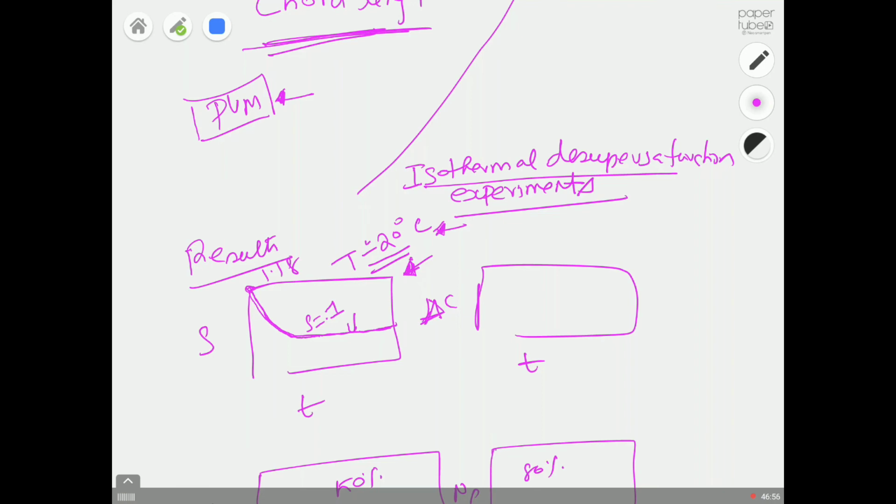Then you can tell me some reasons. If you take this delta C versus time, the 50% curve will be like this, and the 80% will crystallize much faster, so your reaction will come to an end faster. And the reason is simple.